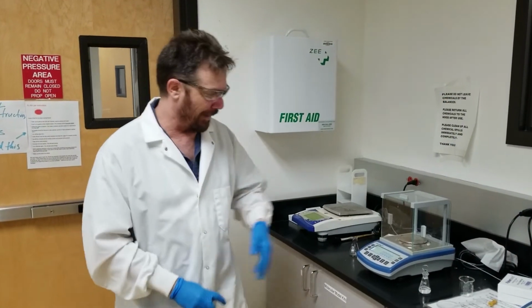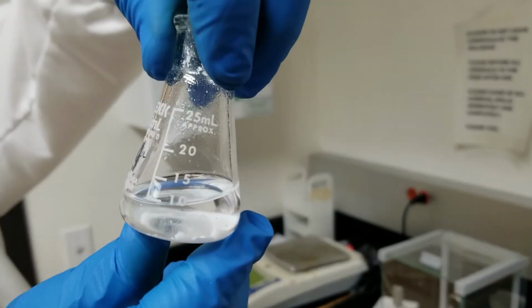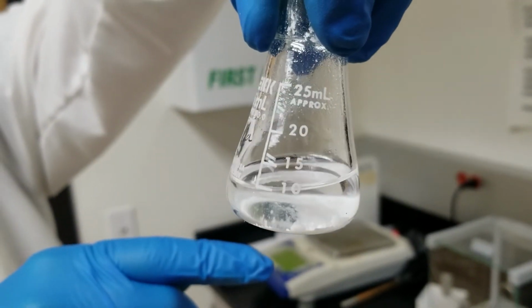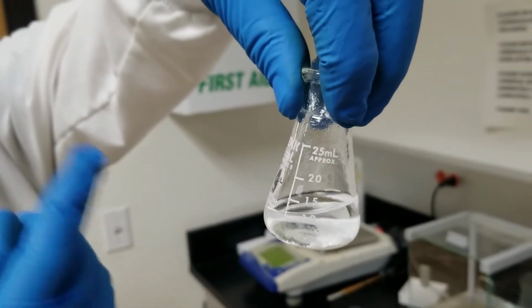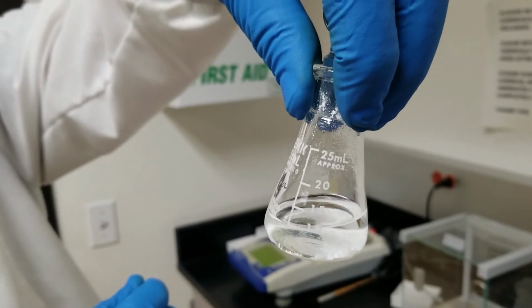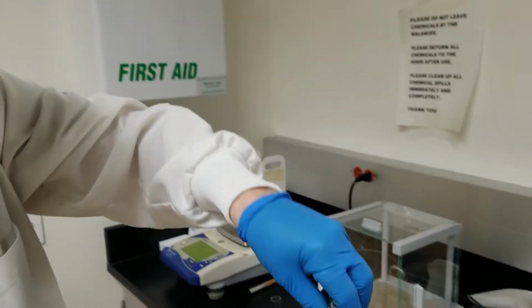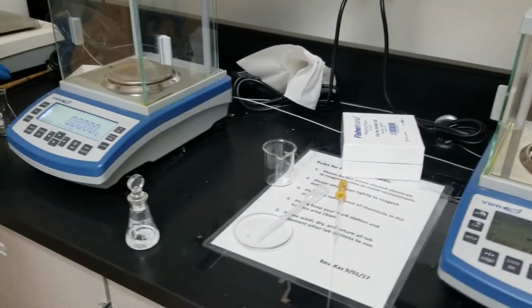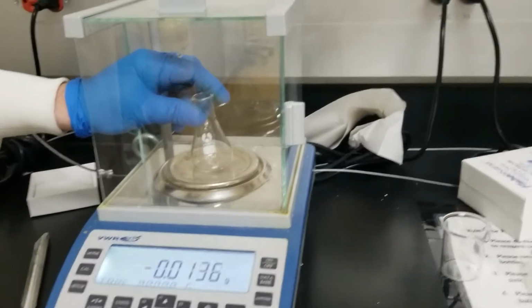Okay, we're finally here. We have our nice clear product. Look at that, clear. It was all cloudy through the distillation. We washed it. Now the drying agent's taking the water out. I'm not going to swirl it, but it does make a nice snow globe kind of effect. So we want to carefully decant that. But before we do that, let's get a weight on this flask that we're going to put it into.